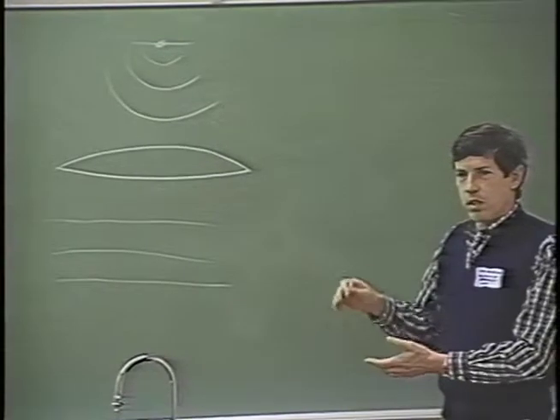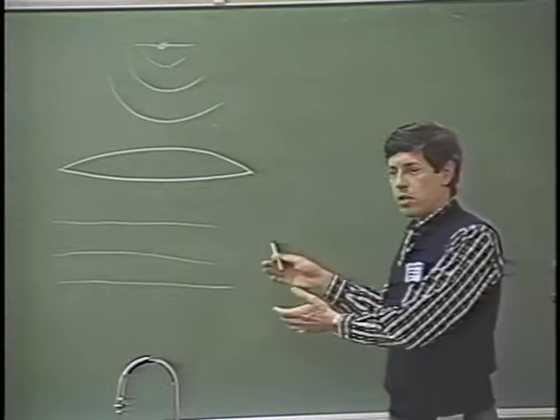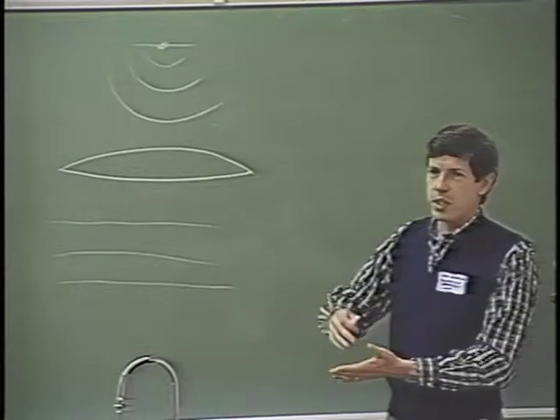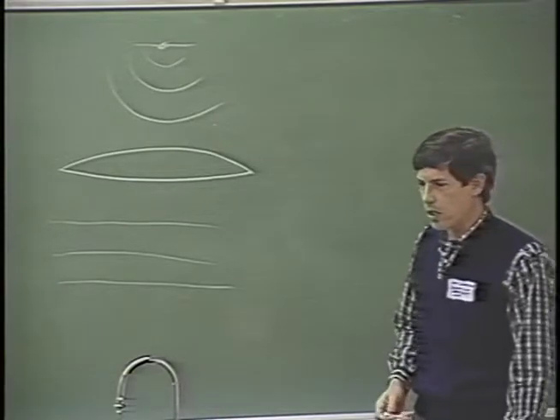The purpose of the defocus that you use in order to produce phase contrast is to add a little more phase shift so that the unscattered and scattered waves are out of phase exactly by half of a wavelength so that you get destructive interference. That'll generate the image contrast.